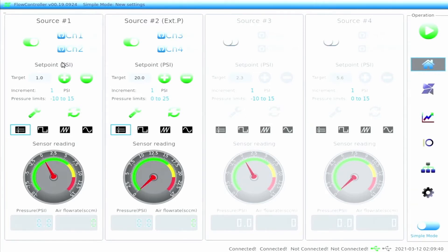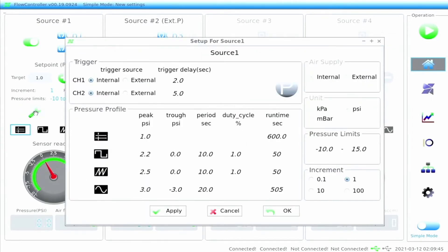Within the parameter setting zone, the user can make changes to the nature of the pressure source. By pressing the wrench icon, the user can adjust trigger condition settings, pressure settings, air supply source, units of pressure, pressure range, and unit increment.